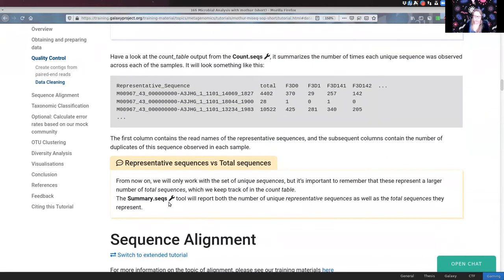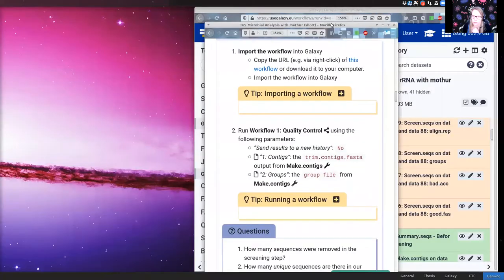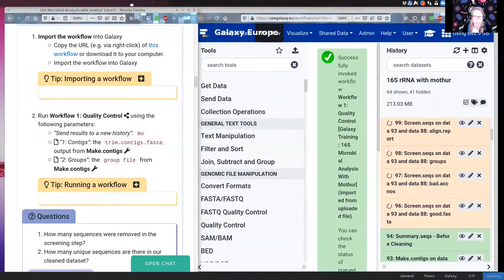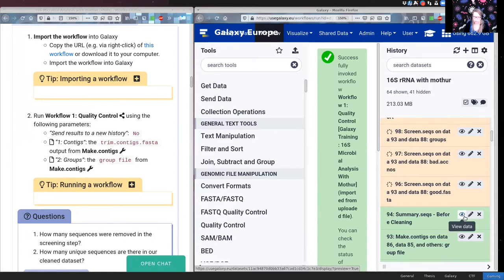summary.seqs will show information about our current dataset and tell us both how many unique sequences we have and how many total sequences those represent. Let's check on the results — the first summary.seqs before cleaning is done. We do a summary before and after the cleaning step so we can see how well it worked.